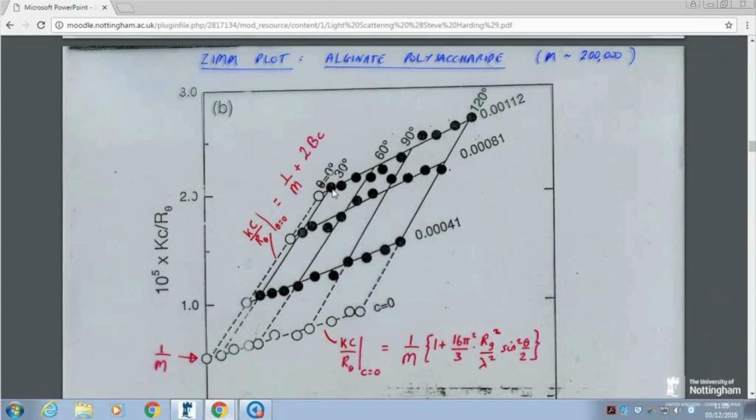No. So Zimm, I met Zimm when we got the, it's 50 minutes left to go, folks. Not quite there yet. When we got the, yeah. Have you all seen our MALS instrument? You know when we did the concentration stuff, there was the dynamic light scattering instruments on your right. On the other side was the MALS apparatus.